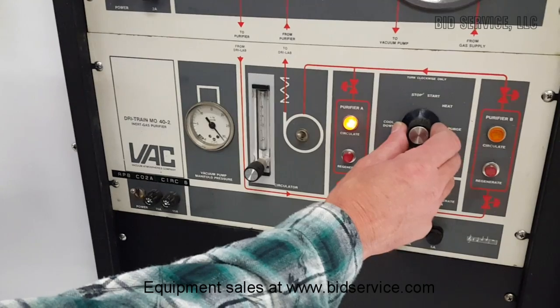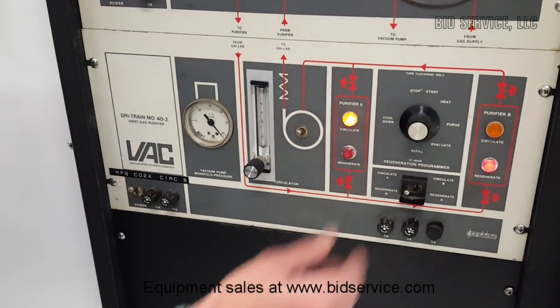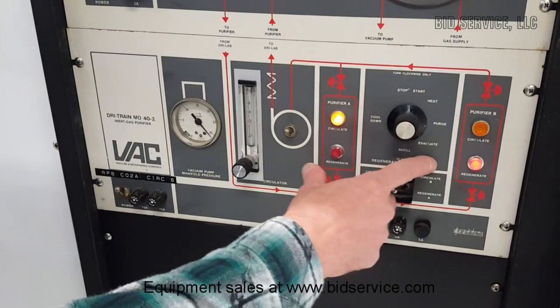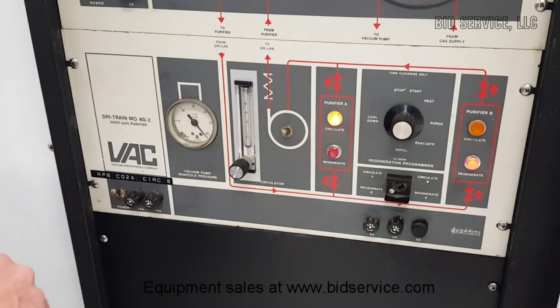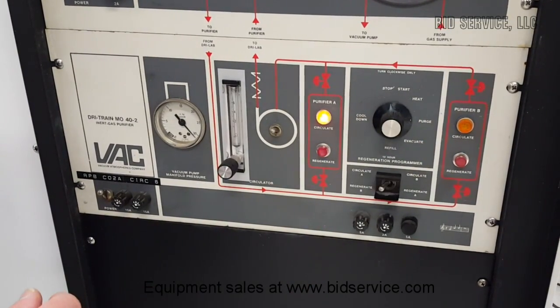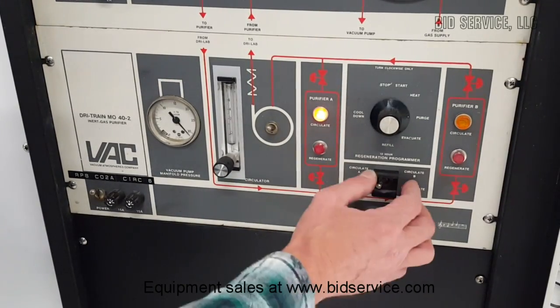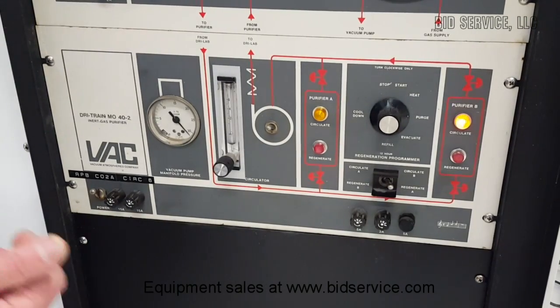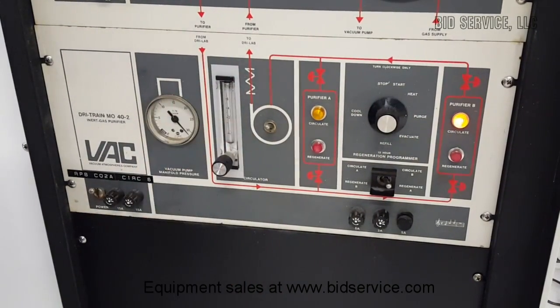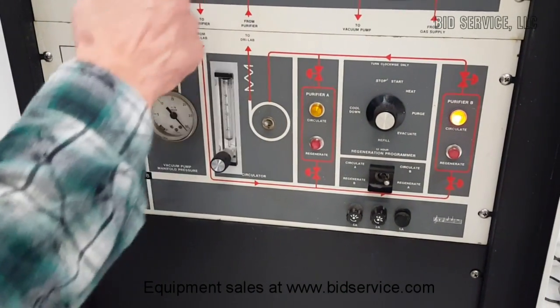To do a regeneration, all you need to do is bring this over to Start. As you can see it's regenerating B while circulating through A, so you can do a regen while still circulating. The first part of the regen is the heat cycle, then a purge with forming gas — nitrogen with 5% hydrogen — then it evacuates through the vacuum pump and backfills using gas from inside the glove box. This regeneration takes about 13 hours. You can switch between purifiers using the air-operated valves — switch over here, and now your other purifier is being used through the circulator.